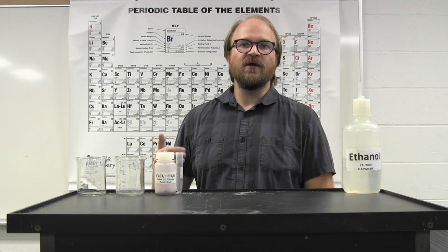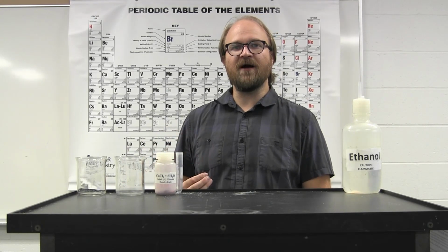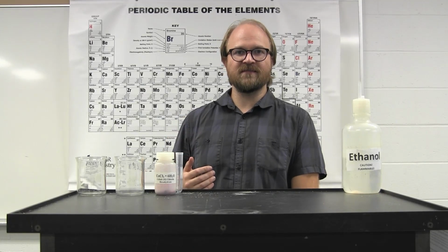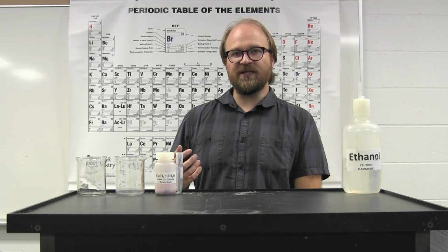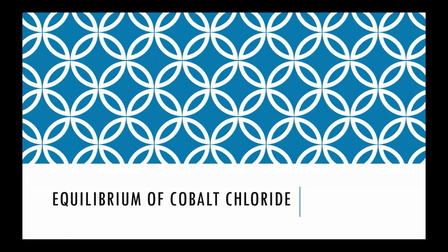And later on, you can see that it's temperature dependent, and you can figure out with the concept of heat and thermodynamics whether energy and heat is either a product or a reactant. This experiment focuses on looking at the concept of equilibrium, and specifically the equilibrium of cobalt chloride.